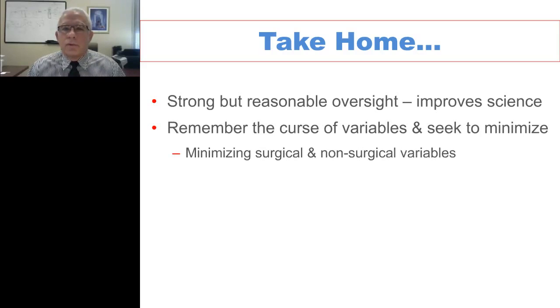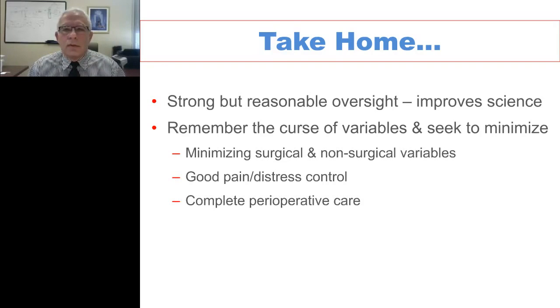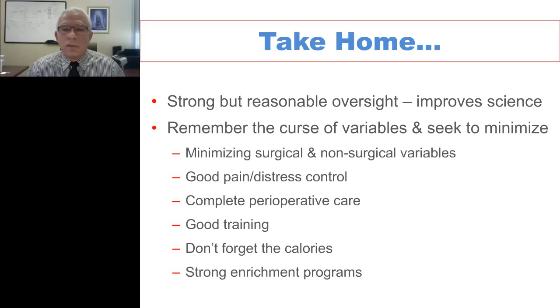Don't forget about variables, because we need to minimize surgical and non-surgical variables for good outcomes. Don't forget about good pain control. Don't forget about the complete perioperative care, and with that I mean the pharmacological and non-pharmacological, the fluids, the warming of the animals, the normothermia. And don't forget that good training leads to good surgical technique. And don't forget the calories. And as for enrichment, a good, strong enrichment program will yield better results.